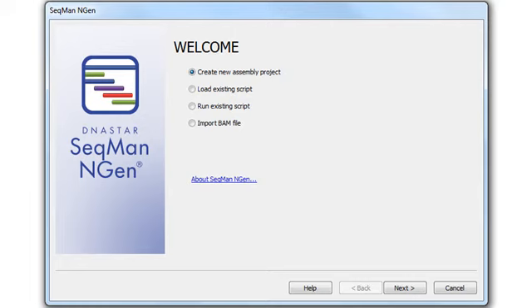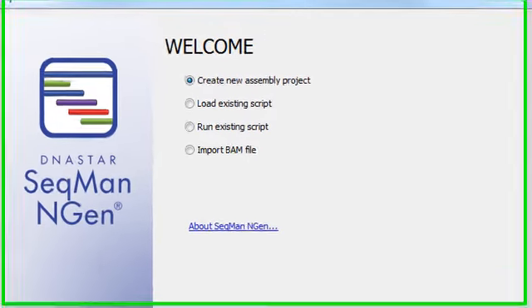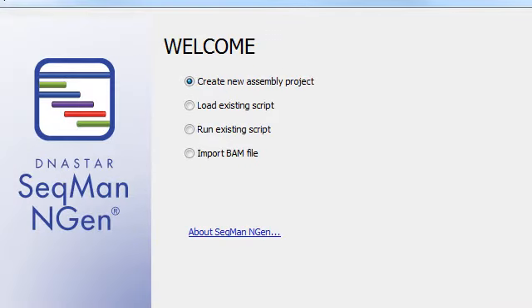In this video, I'm going to walk you through running a de novo assembly of E. coli mate pair data from Ion Torrent. The first step is to launch SeqMan NGen, and when you do that, you'll see a welcome screen like this.